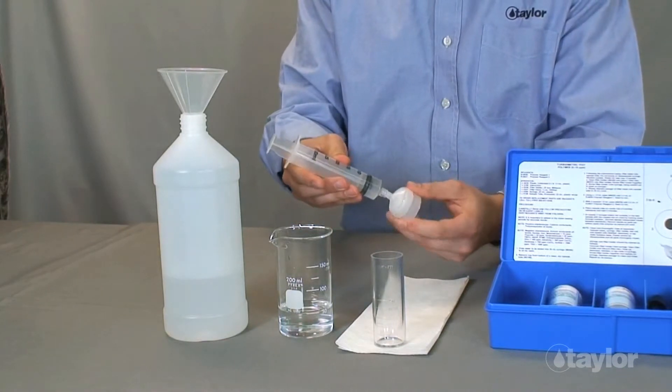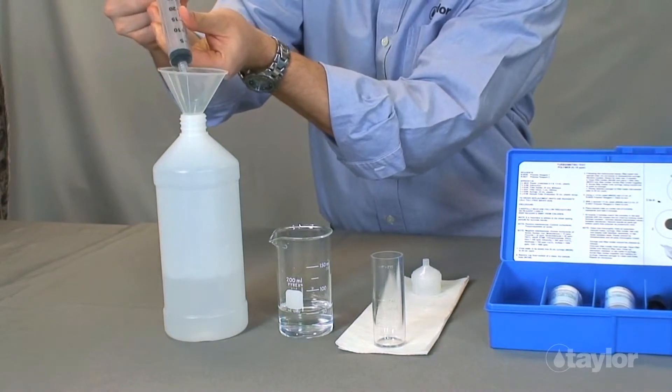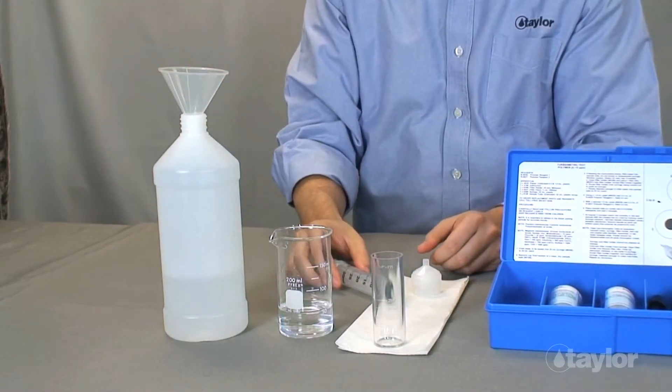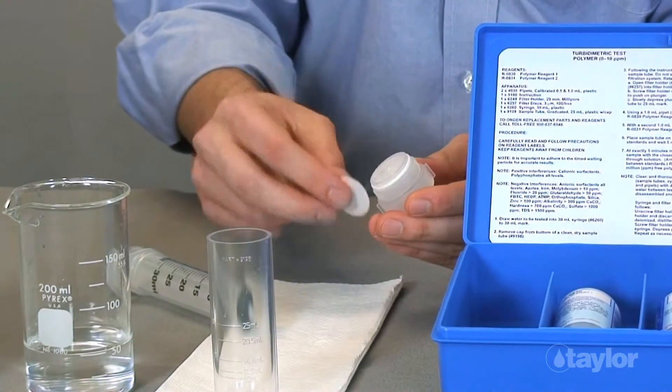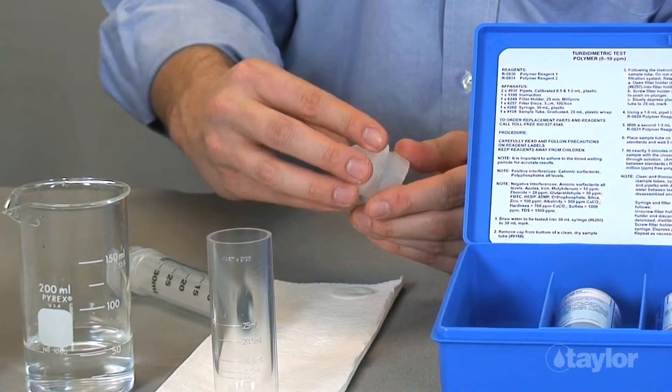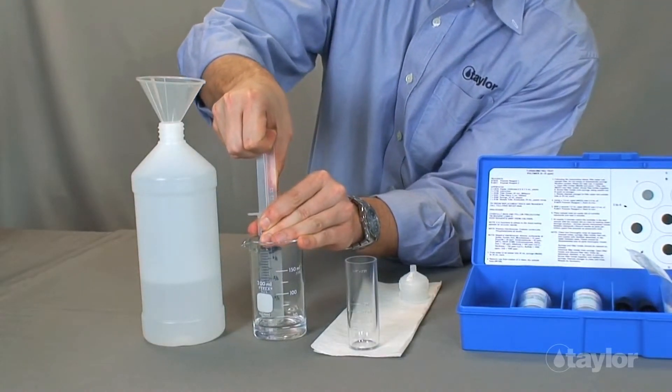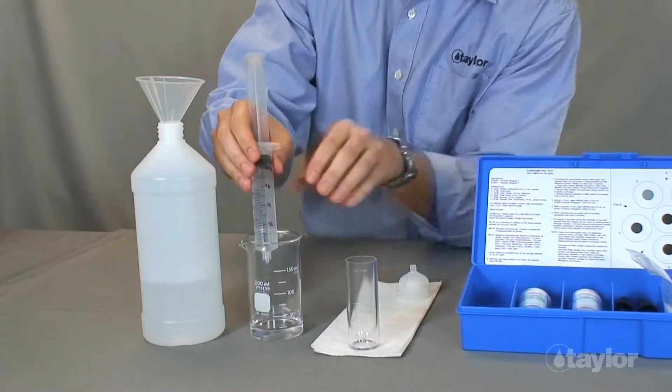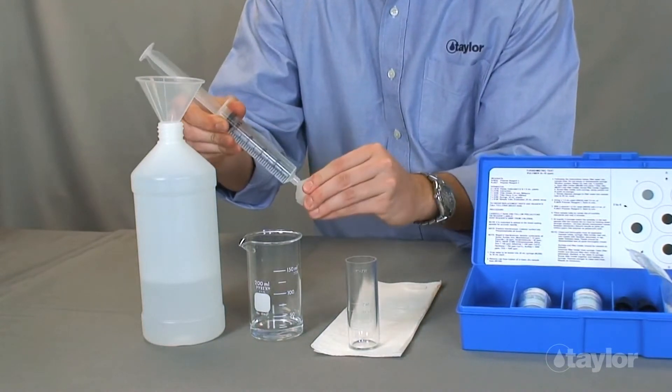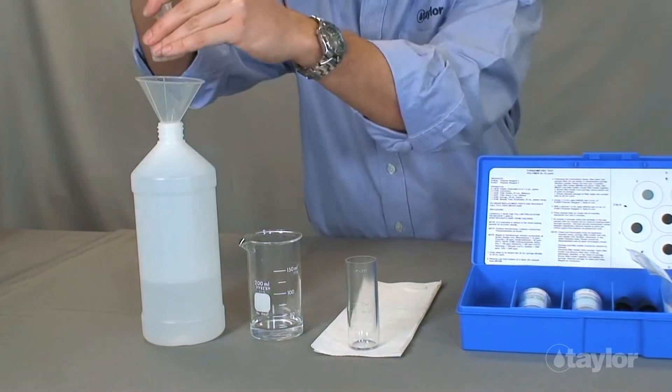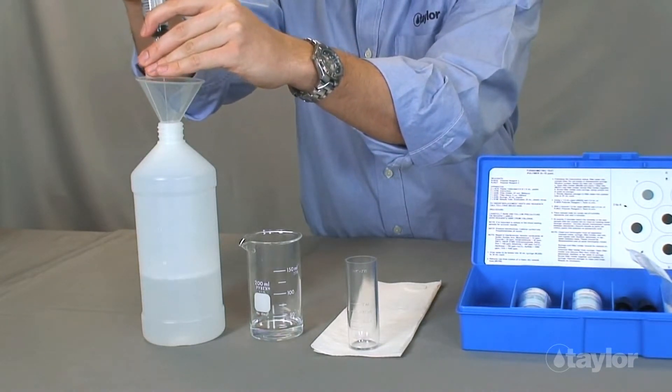To clean the syringe filtration system, unscrew the filter holder. Open the filter holder and remove and discard the used filter disk. Close the filter holder. Draw up deionized, distilled, or tap water, and reattach it to the syringe, then depress the plunger to expel the contents. Repeat as necessary for thorough cleaning.